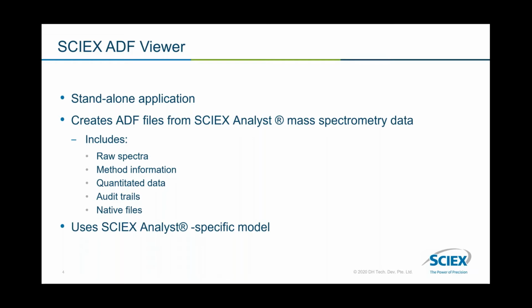We have implemented a SCIEX-specific model. It is essentially a hierarchical data model where at the top we have a result set. Beneath that we have the multiple samples in a run, and associated with each sample we have the analyte information along with the measured values and the metadata for that analyte.